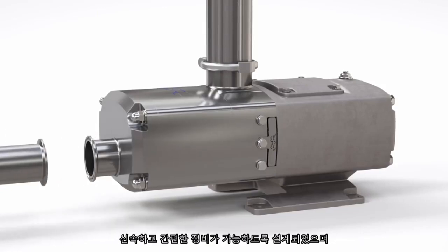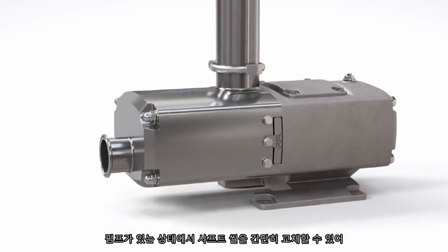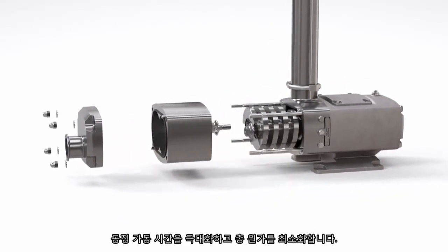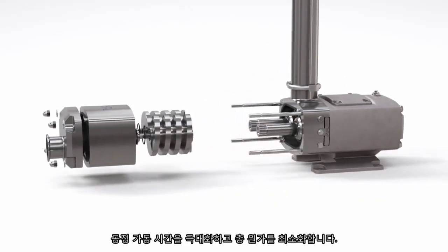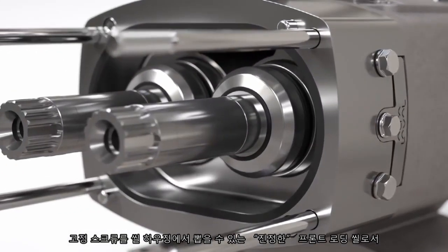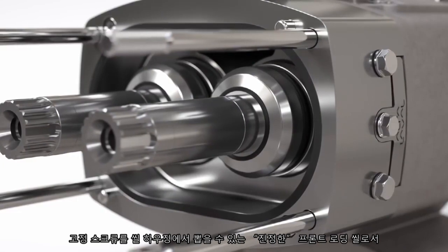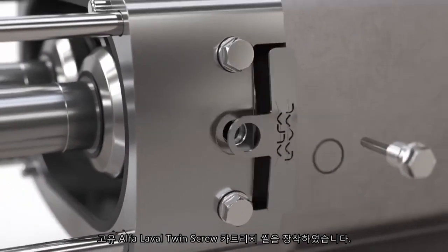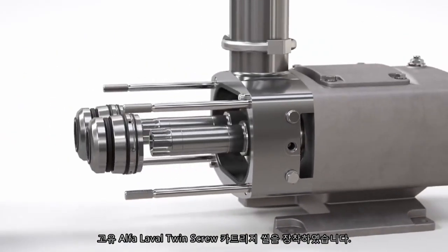Designed for quick and easy maintenance, changing the shaft seals with the pump in position is simple, maximizing process uptime and minimizing total cost of ownership. Incorporating the unique Alfa Laval twin screw cartridge seal, a truly front-loading seal is easily accessed by removing the retention screws and simply pulling out of the seal housing.